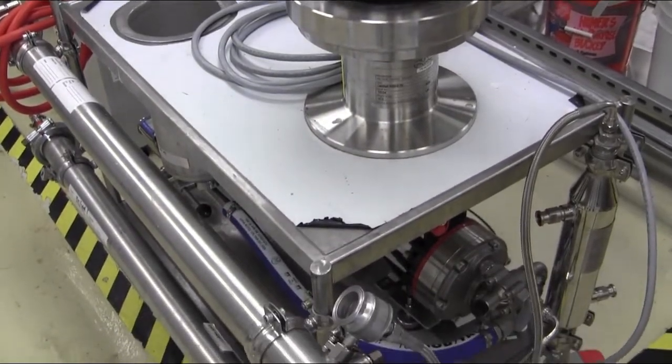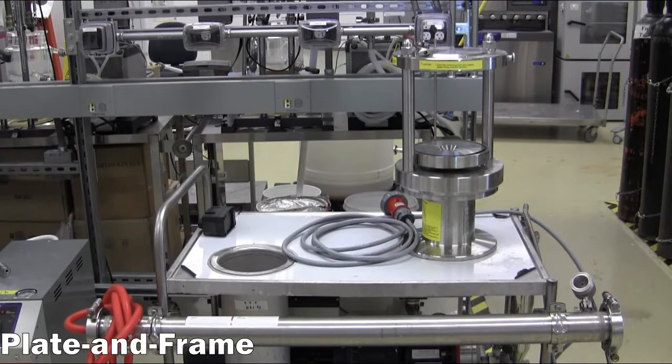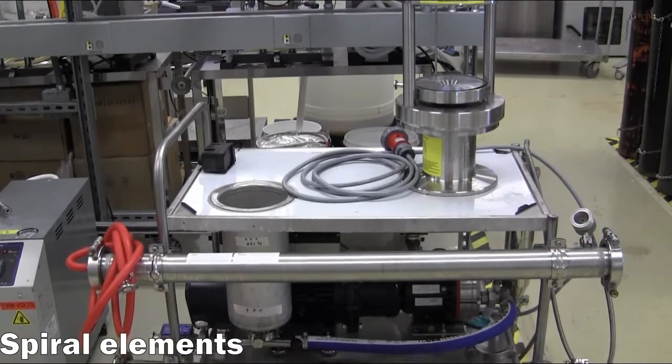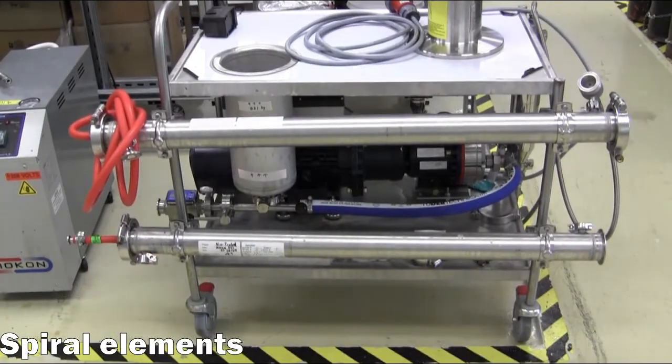The M20 consists of two functional units: a plate and frame style press that can be used to evaluate various flat sheet membranes simultaneously, and a pair of larger cylindrical housings that are used to evaluate spiral wound membranes at a considerably higher throughput.